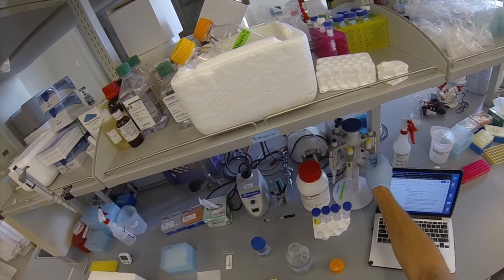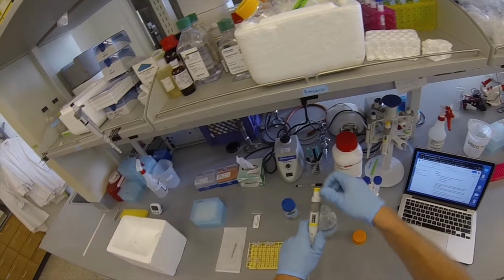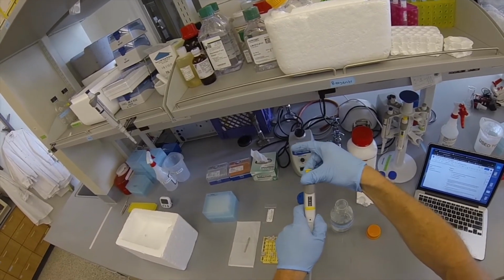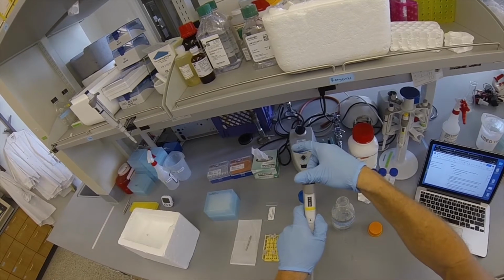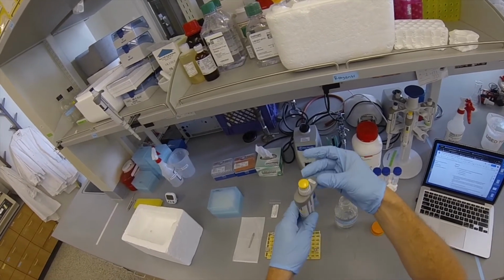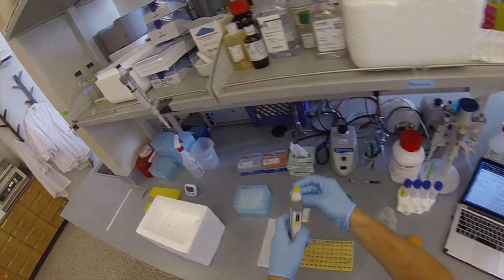Now you're going to add 42 microliters of 0.5 molar EDTA to each sample using the 100 microliter pipette. Make sure to cap all reagents after you're done using them. Here you can see I forgot to cap the cell lysis buffer.